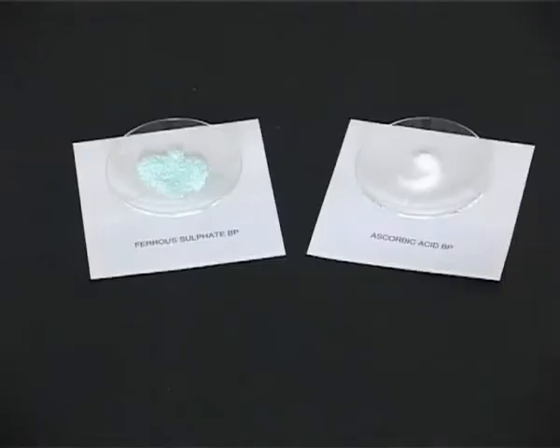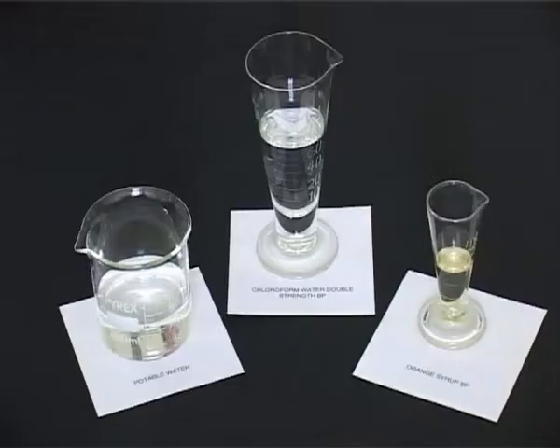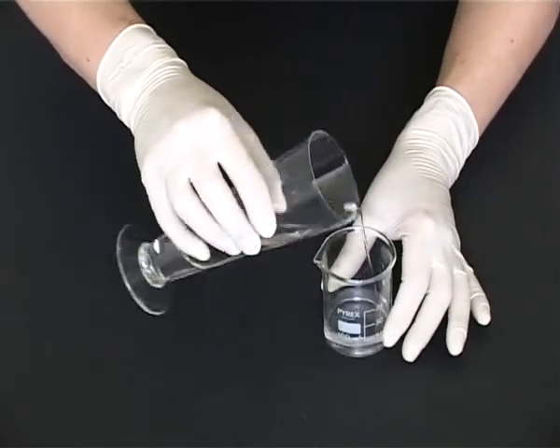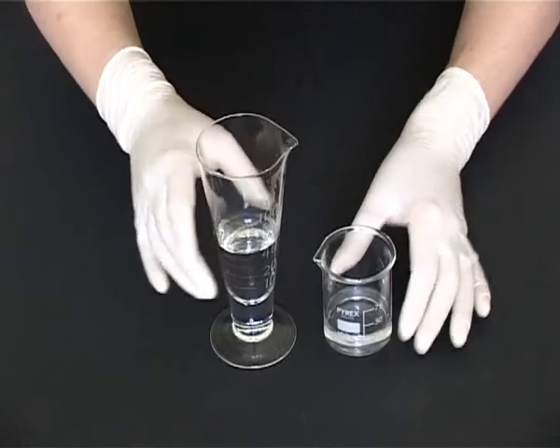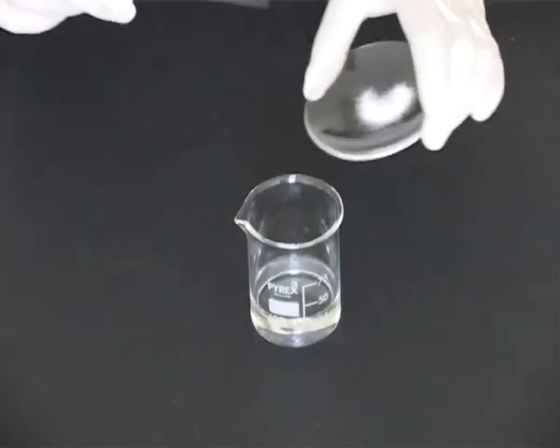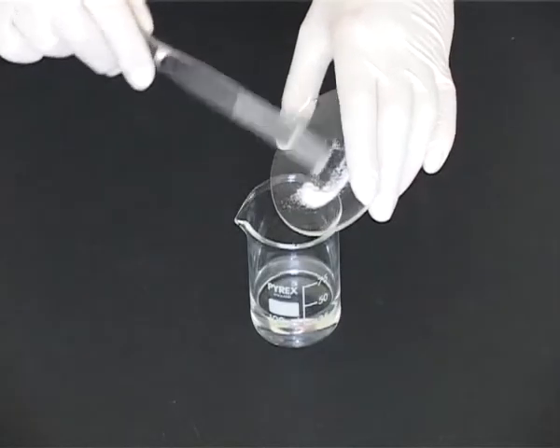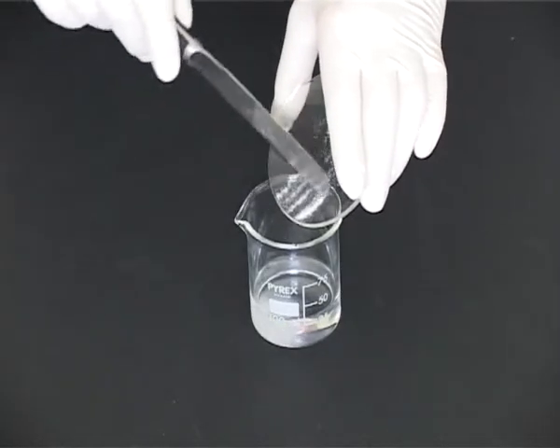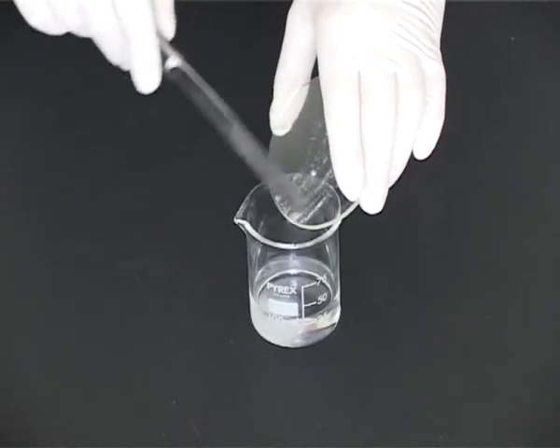When preparing a solution, weigh any solid ingredients and check their solubilities. Pre-measure any liquid ingredients using the smallest possible measure and prepare any double strength chloroform water required. Choose an appropriate container in which to make the solution — a glass beaker is usually most suitable as it allows stirring to aid dissolution. Calculate the quantity of vehicle required for dissolution and place approximately that amount into a beaker. Remember, if double strength chloroform water is used in a product, this must be used for dissolution.